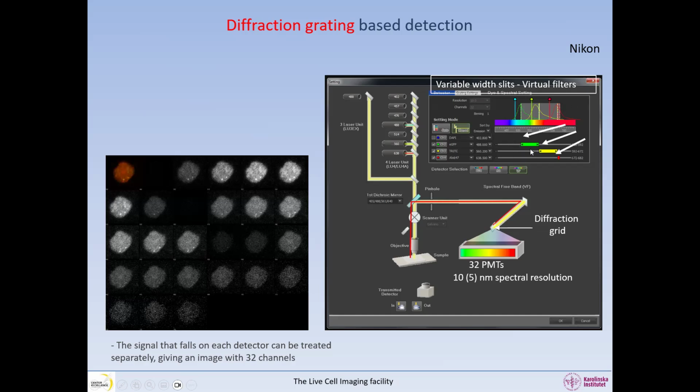For example, if you want to image the green emission light, you pool together several detectors and only detect the green emission. You can do the same for the yellow or the red, depending on your fluorophore and what you read off your spectrum, so that it's more convenient to avoid, for example, bleed-through.